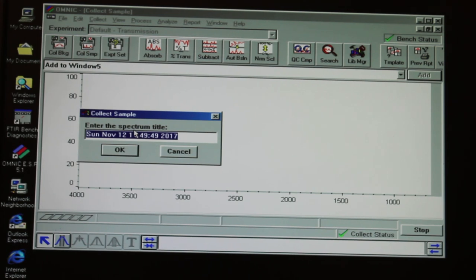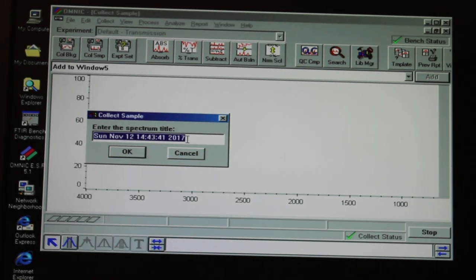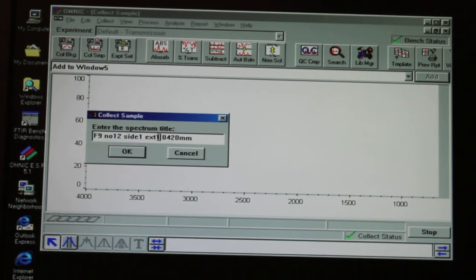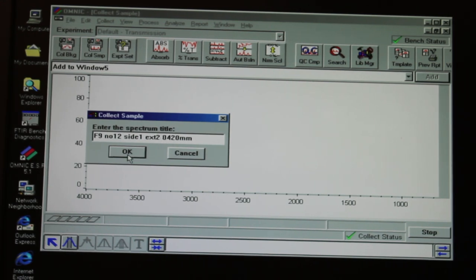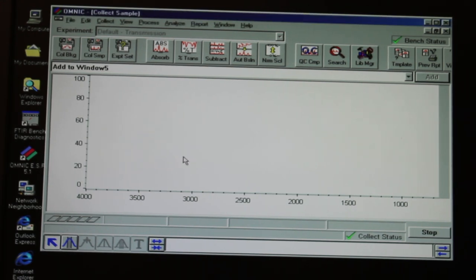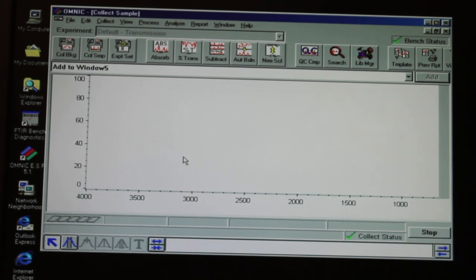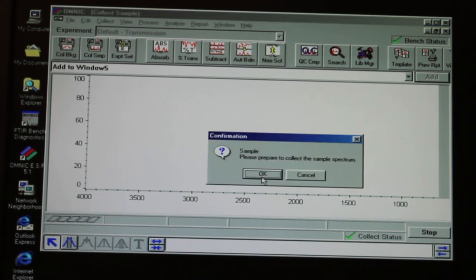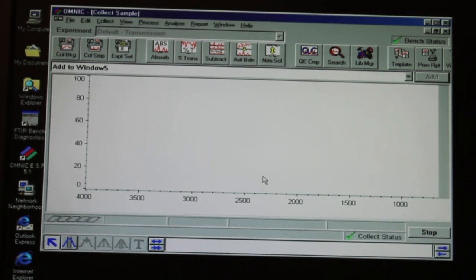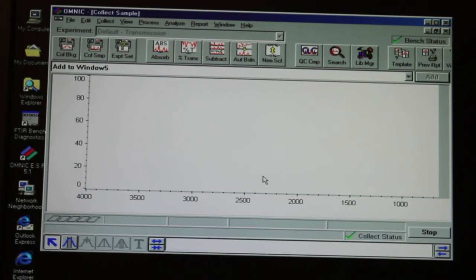Then hit the Collect Sample button and name your spectrum according to the sample name, the thickness of the sample, and other important information like the polarization direction. The software will start scanning your sample. You may have to tell it to do so by clicking OK.